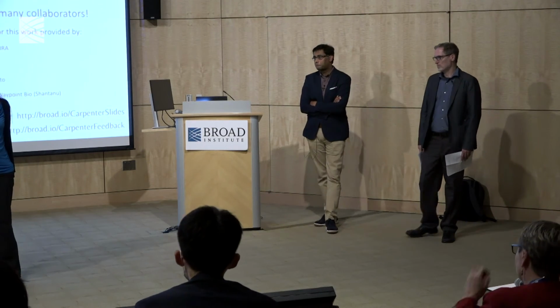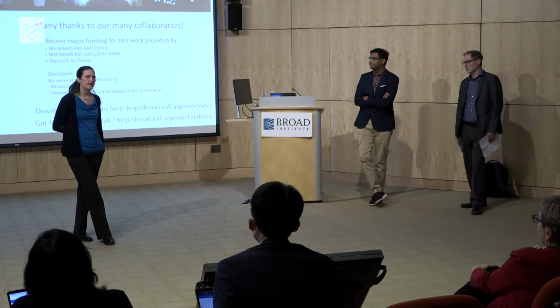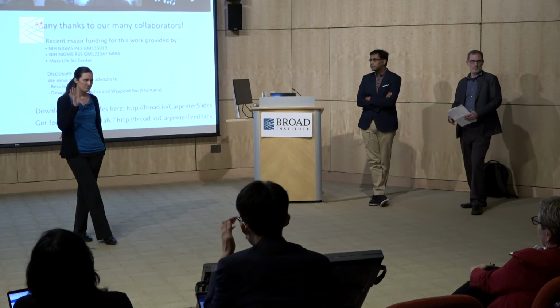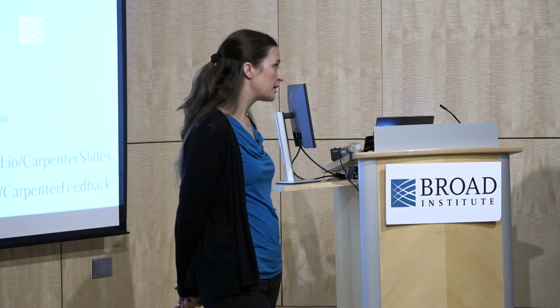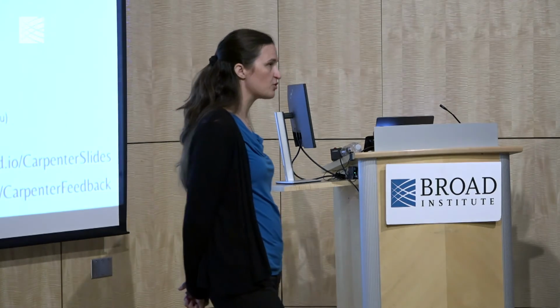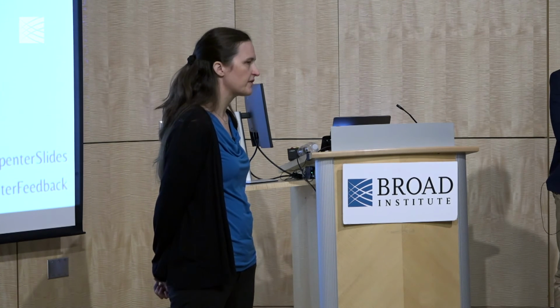Yeah, I love this question. Up until this year, we've had 30,000 compounds to work with in the field in general, and that came originally from a project, for those who remember the MLSCN or the MLPCN consortium project through the NIH. It was a subset of compounds there. Some proportion of them were diversity-oriented synthesis in origin, so they had some interesting variety of structures, and then some proportion were bioactives. I don't think any natural products, but at least bioactive compounds.